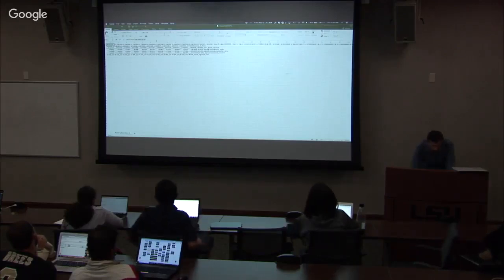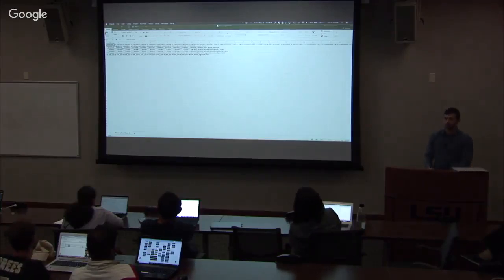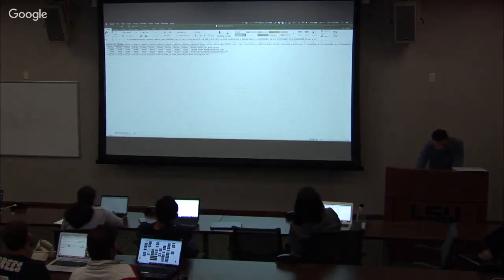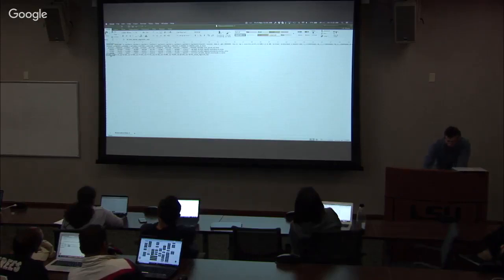So I can look at it. It utilizes the alignment mapping. The SAM file is the alignment mapping. And then this, for example, would be my second sample. Now I want to check whether between these two there is a difference in how many reads were mapped. So you can see that this was 74%, this was 76%, 81, 63, etc. So the overall alignment varies.